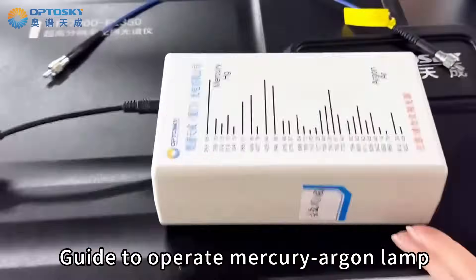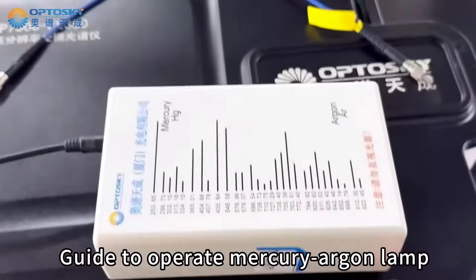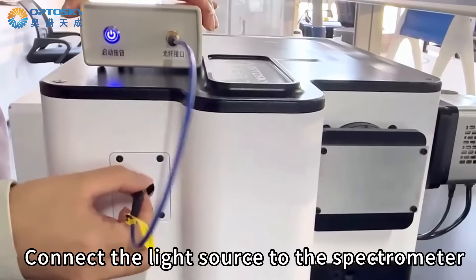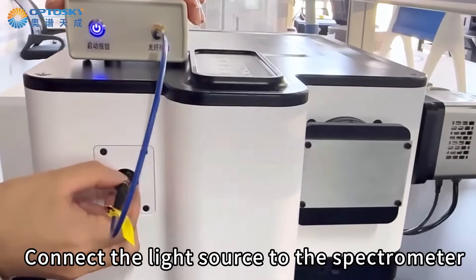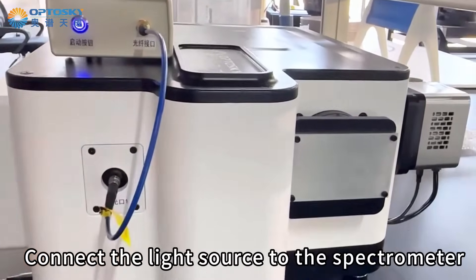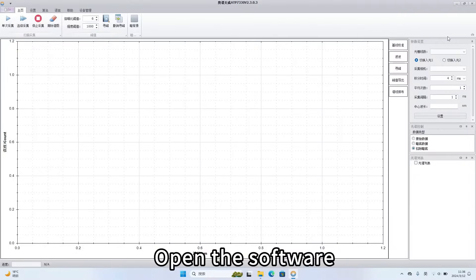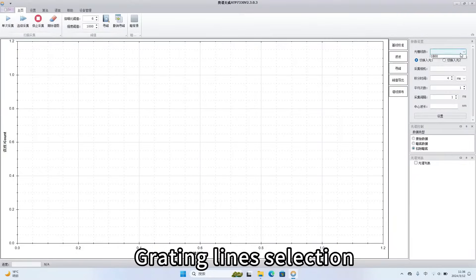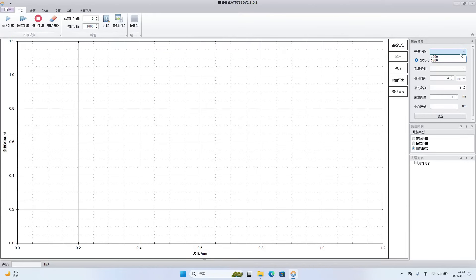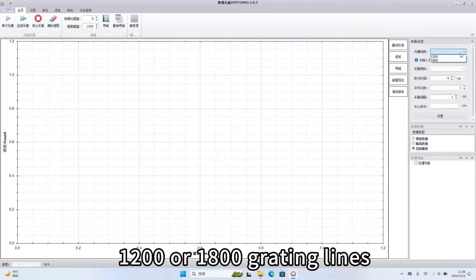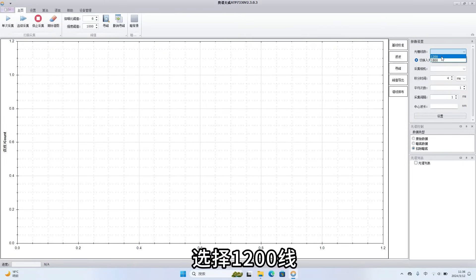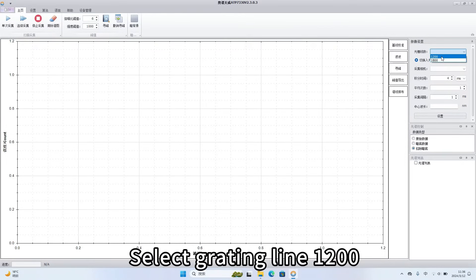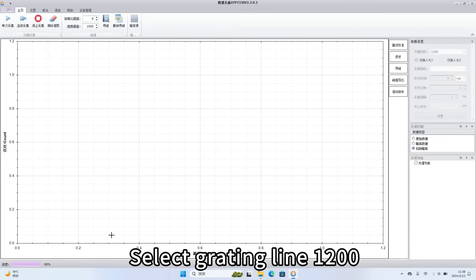Guide to operate Mercury Argon lamp. Connect the light source to the spectrometer. Open the software. Grating lines selection: 1200 or 1800 grating lines. Select grating line 1200.